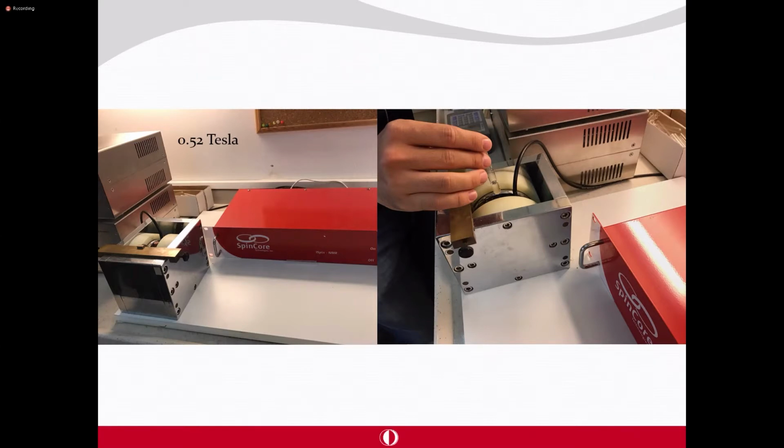Here you see the red box is where the spectrometer is, so the RF pulse is being generated from there. And on the right, the metal block is the magnet. We have two discs that are looking at each other, and in between these discs there is a radio frequency coil where you put the sample, and the sample is in a 10 mm tube.